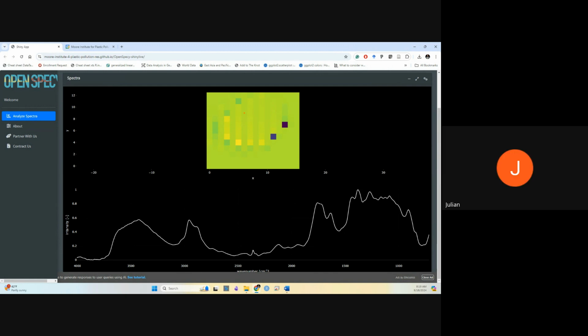I'll unmute because it's too long to type. So I get the background. I understand hyperspectral imaging. It's remote sensing. People use that type of thing as well. But I don't have experience on the practical side. So, is this we stick our filter paper under an FTIR and then stitch together some composite of images with a 25 micron grid size?